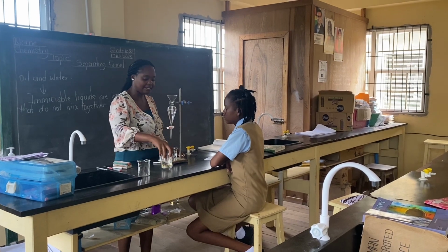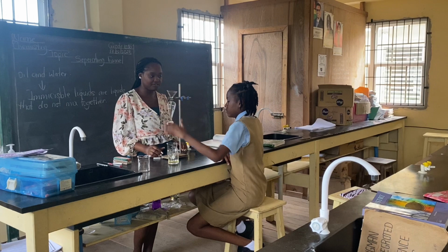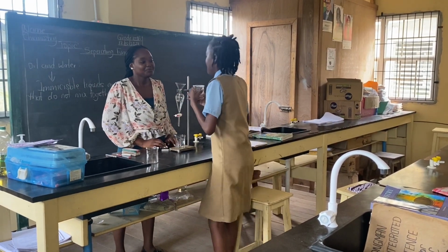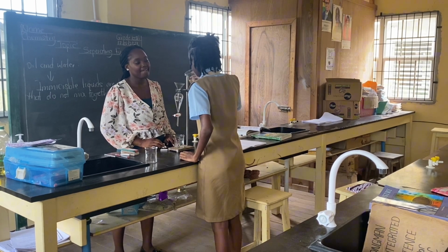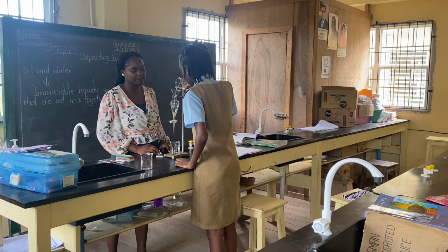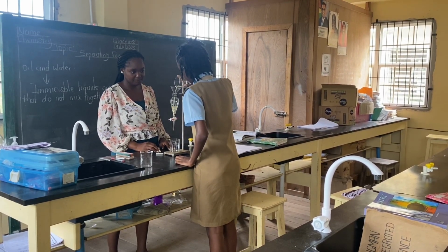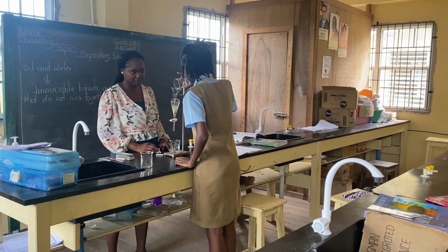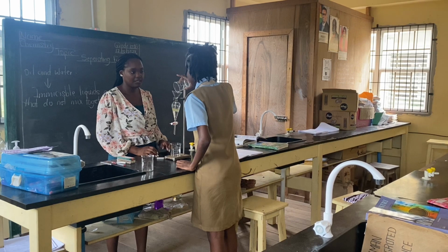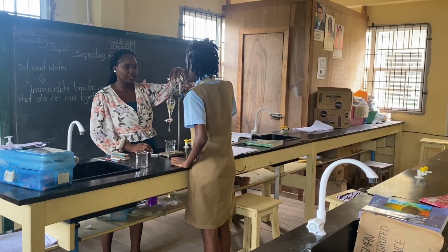Now, can you add our oil and water to our separating funnel? Alright, remember when we're pouring, we always pour using the spout, right?